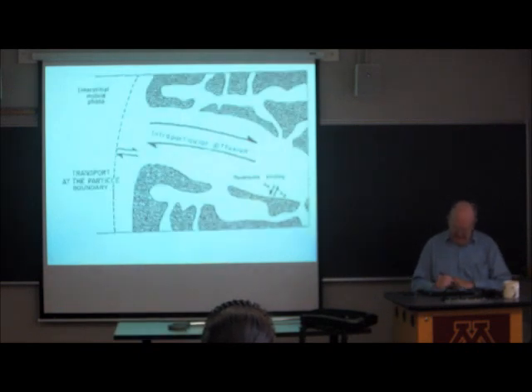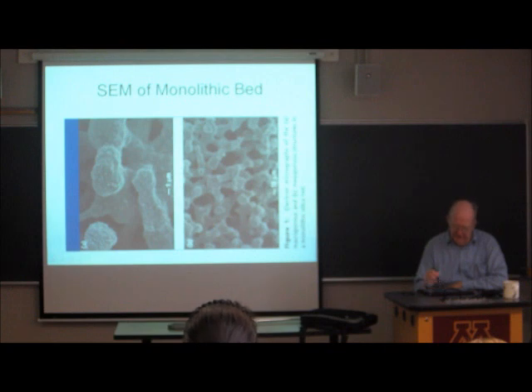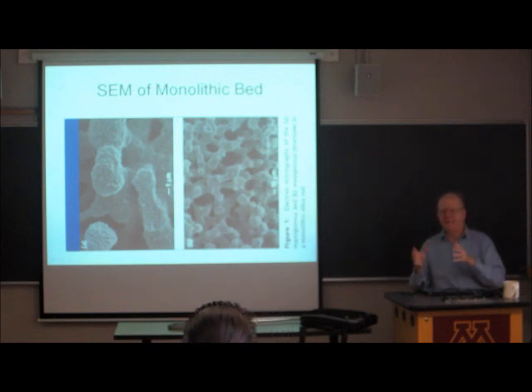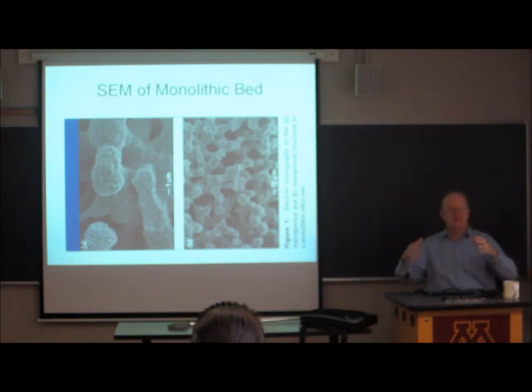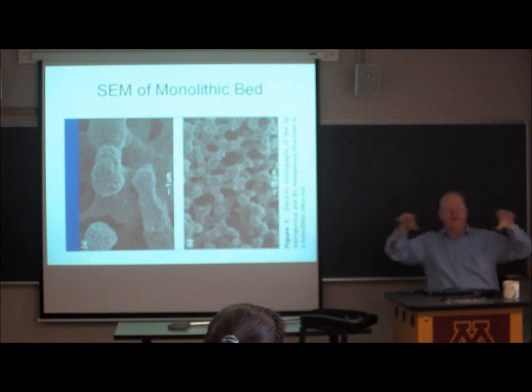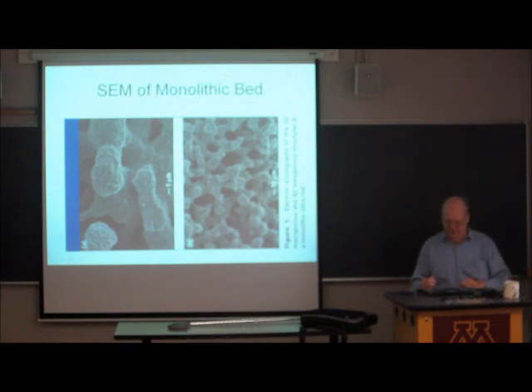I'm going to skip that for the time being. Here's a neat material called a monolithic bed. This turns out to be a silica bed. A monolith. Mono means one. Lith is Greek for rock. The entire inside of the column is one piece of silica, where all of the chunks of silica are physically unified into a single body. It's really neat stuff. This is a relatively new development in HPLC.